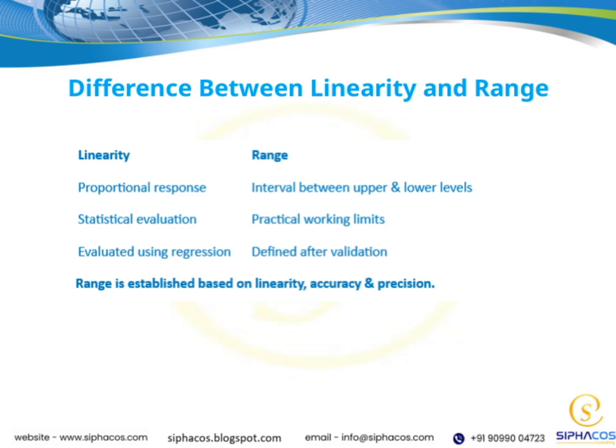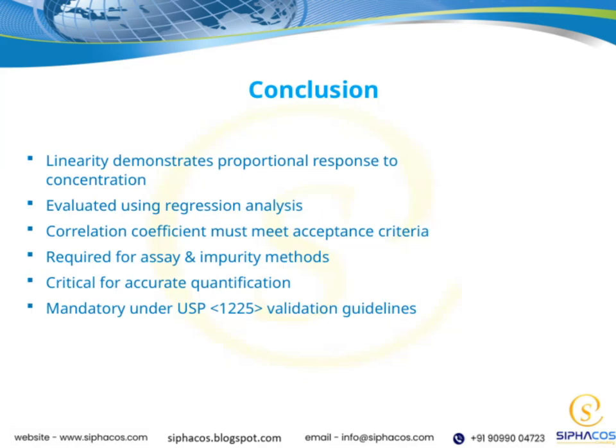On the other hand, the range is about the scope of values that our system or measurement can handle effectively. It tells us the limits within which our data or system operates reliably. Recognizing this distinction helps us better interpret data and design systems that are both accurate and functional within their intended scope. So, while linearity is about the relationship's nature, the range is about the boundaries within which that relationship holds true. Let's wrap up with the key takeaway on linearity.